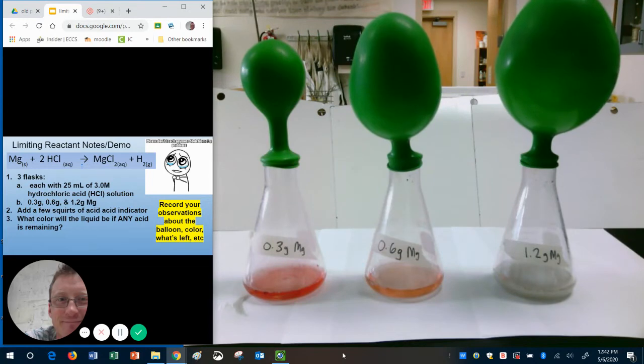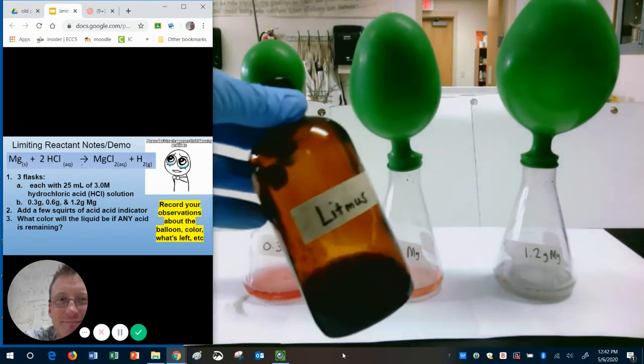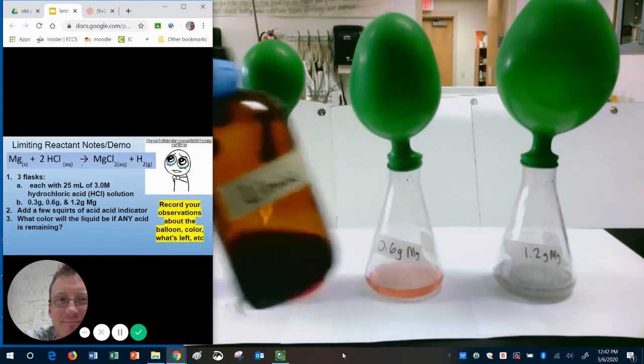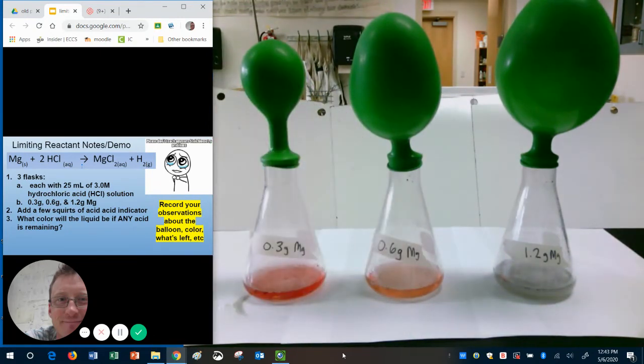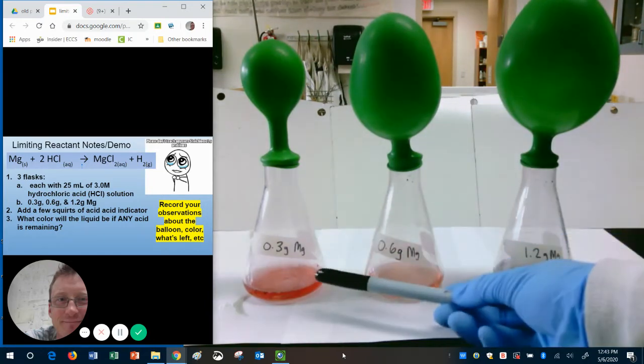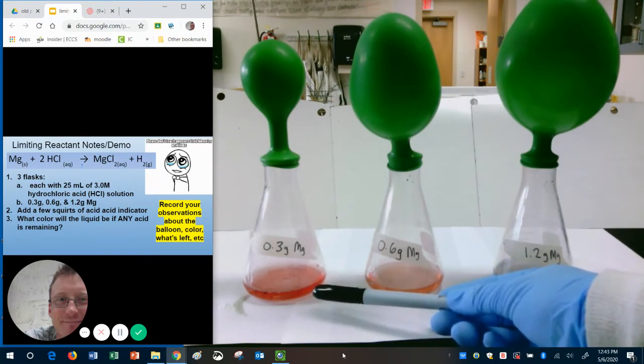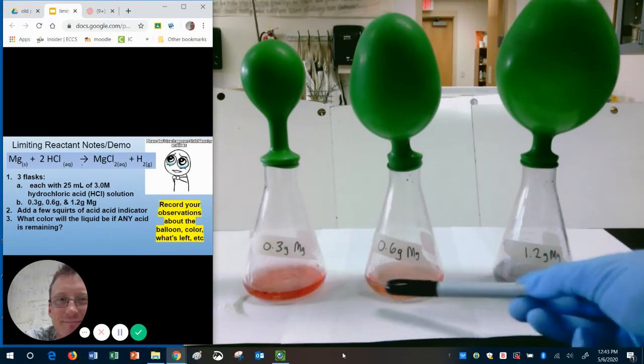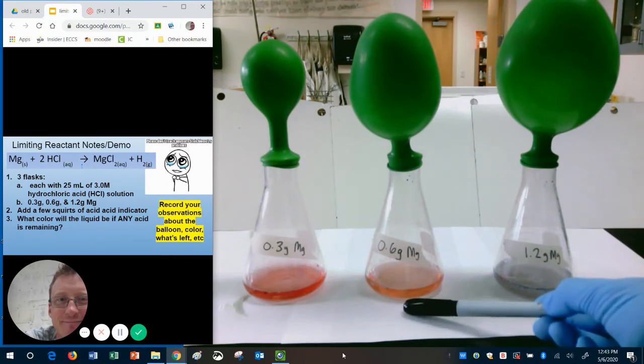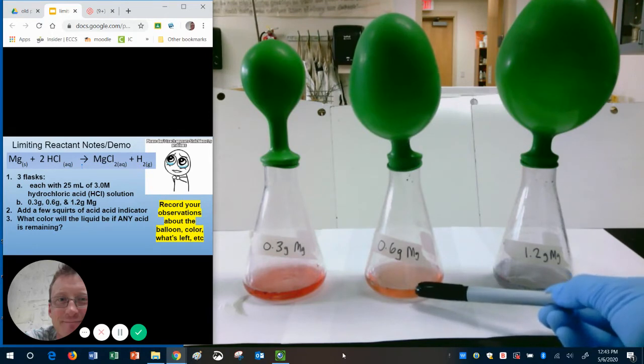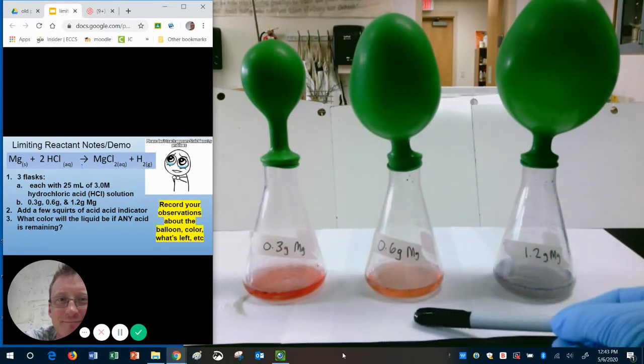According to what we had, if there is litmus in our mixture that is in contact with acid, what color should it be? It should be that pink. And notice, the first one, what must still be left over in our container? It must have some acid because it's pink. And the second one, it's less pink, but there is definitely a pinkish tinge to that liquid. So both of these must have some acid left over.